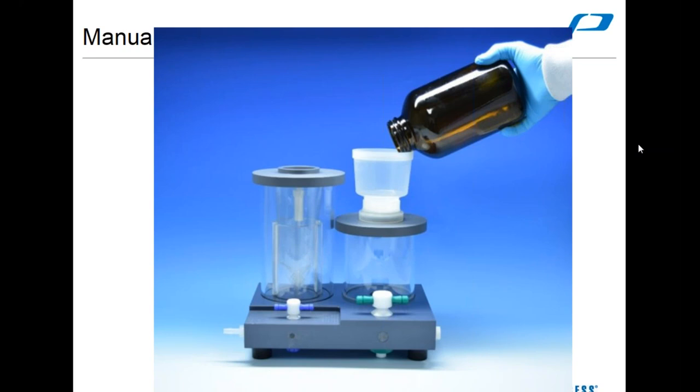A failing sample spike outside of those recovery numbers doesn't make your batch fail. It just requires you to note that your sample has matrix problems. That's really what you're demonstrating with that sample spike. If it doesn't pass recovery, you just write it off as I've got matrix problems in this sample. If it always happens, that's really consistently demonstrating that, especially if even between duplicate samples you have inconsistent results—you're just demonstrating that your sample flow is not consistent.